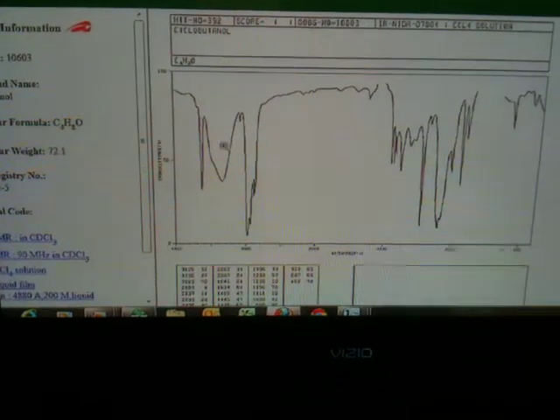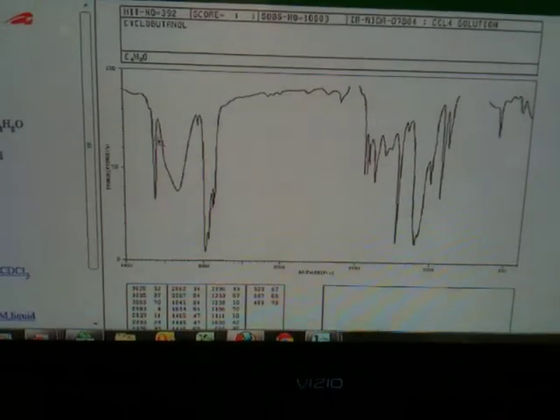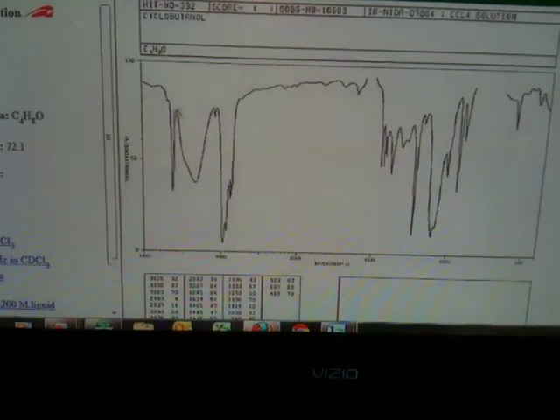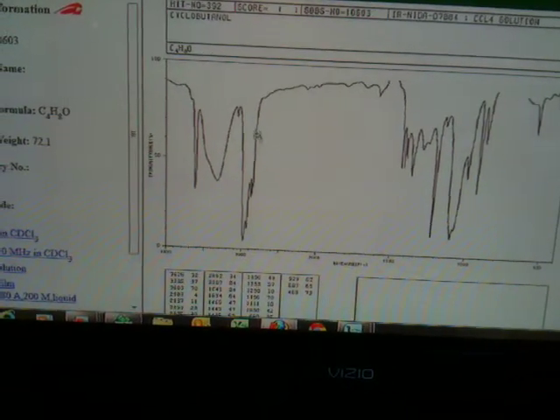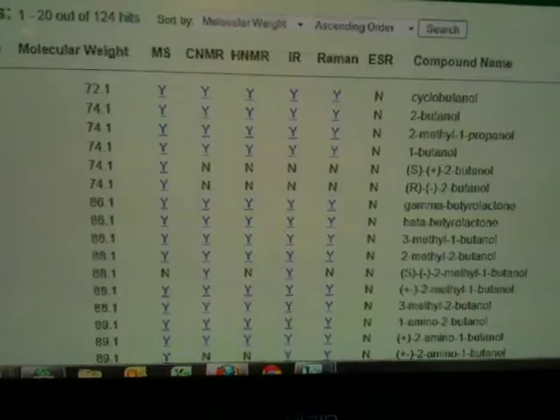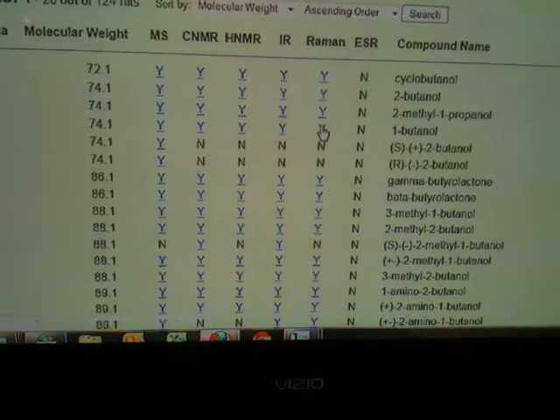Now notice it has some of the features that we just went over. For example, it has the OH. This is actually non-hydrogen bonded alcohol. However they did this, some of their sample is not hydrogen bonded. But you can see the broad peak due to an OH, the sp3 CH stretching. You know, you could just sit around and study these. It's so much fun to do. I'm not being facetious either. Studying images is really interesting because you learn a lot.